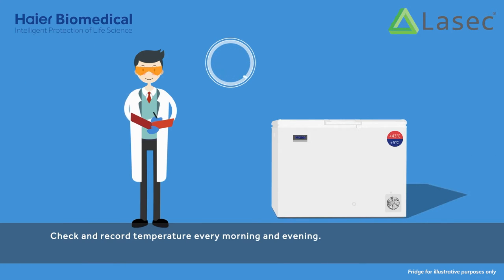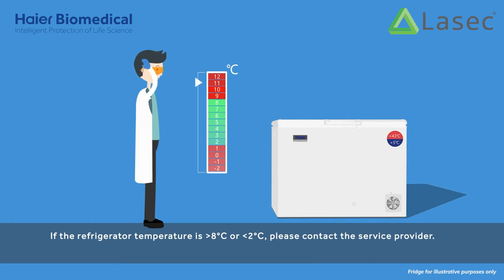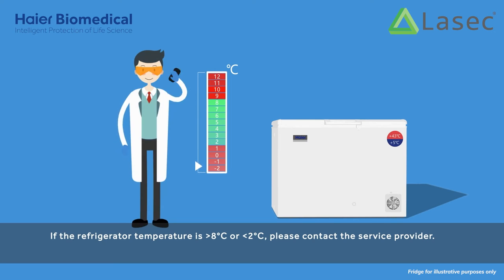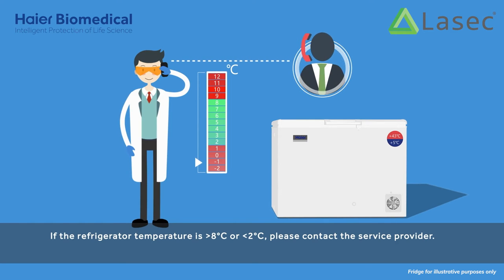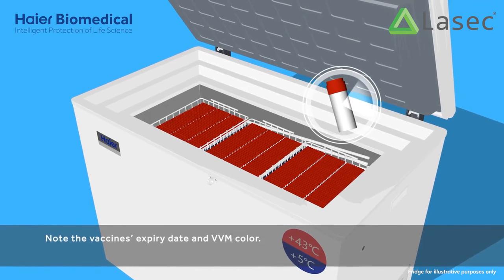Check and record temperature every morning and evening. If the refrigerator temperature is more than 8 degrees Celsius or less than 2 degrees Celsius, please contact the service provider. Note the vaccine's expiry date and VVM color.